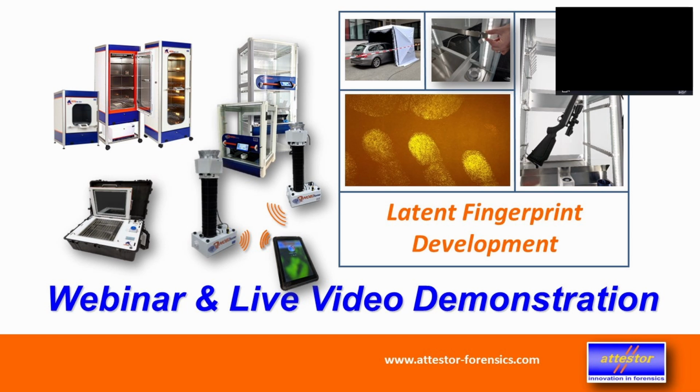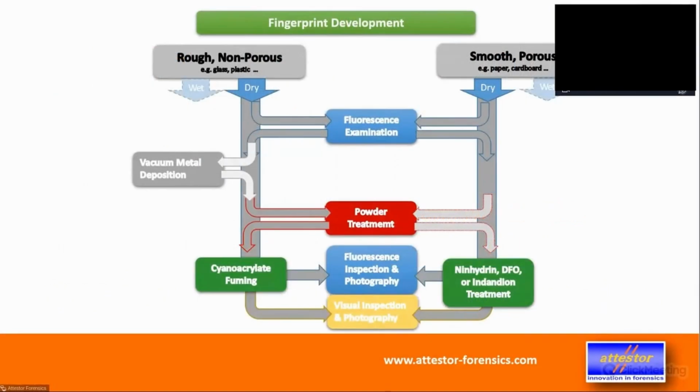Good. I have to switch over to my slides so I can operate them. All right. So these slides are actually from a complete webinar, so they're probably more than what we need for this purpose. But I just use them to illustrate some things which are a bit difficult to show on the actual machine. So I will skip some of the information, even some of the complete slides. If you feel bored, let me know. If you want me to concentrate on something a bit more, let me know as well.